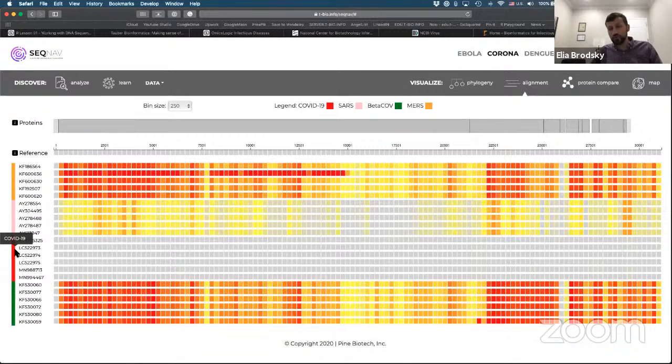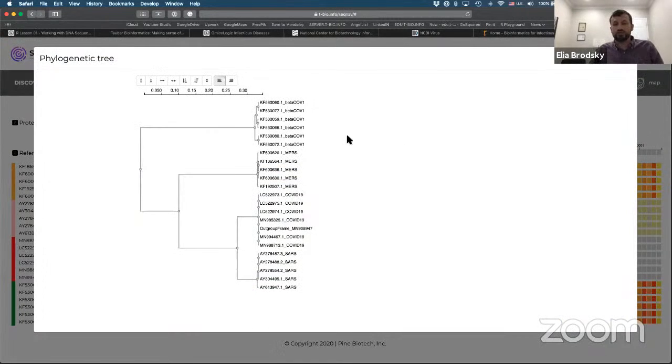That's why SARS-CoV-2 is closely related to SARS-CoV-1, which is this SARS section right here. We can visualize the way that they are interrelated by building a phylogenetic tree. So this phylogenetic tree, you can see it's annotated: beta coronaviruses, MERS, COVID-19, and SARS. And you can see that this clade, right, so this and this, represents a common branch from the main phylogenetic tree for COVID-19 and SARS. So SARS-1 and SARS-2 are the closest to each other based on a comparison between these different types of viruses.